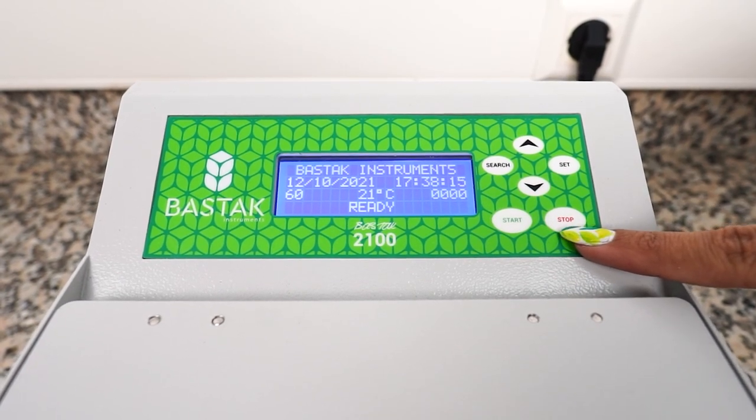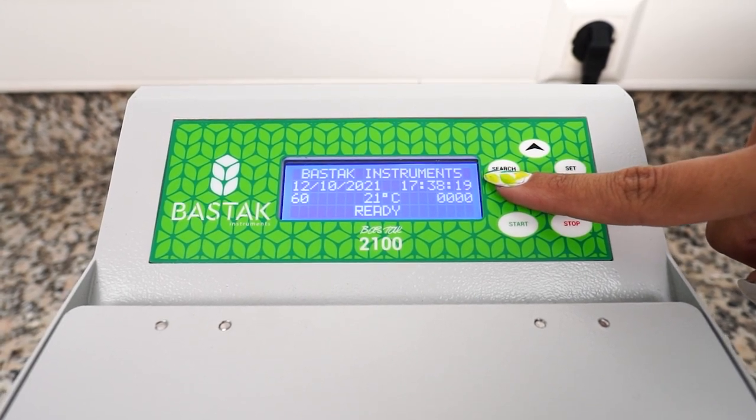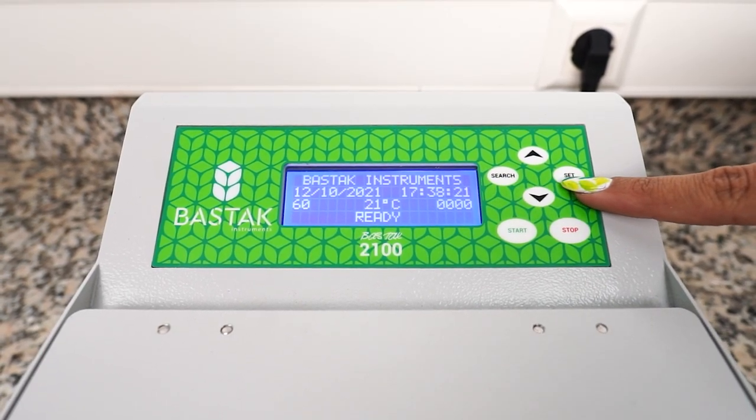Stop is used to end the test. Search is used to set the date and time. Press the set button for one second.